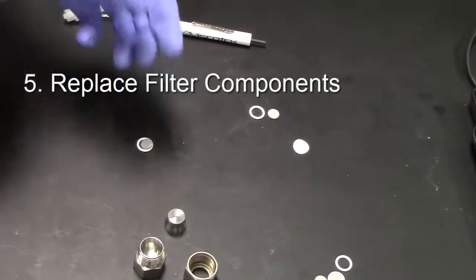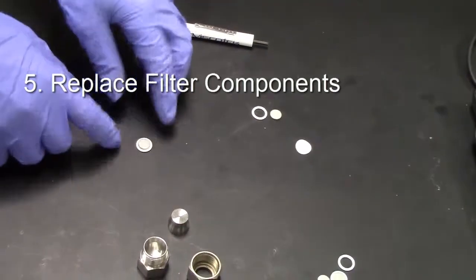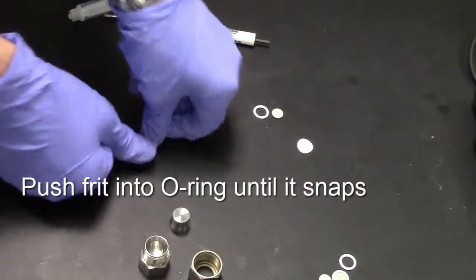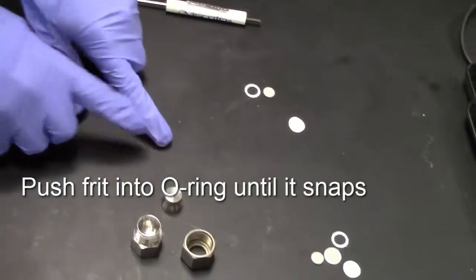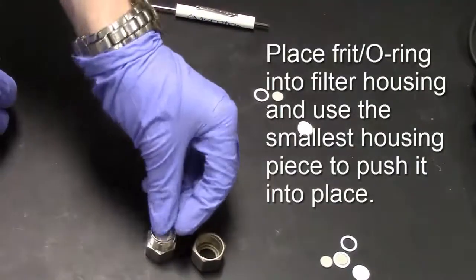Step 5. Replace the filter components. On a flat surface, place the new frit inside a new O-ring and push it into place until it snaps. Flip the pieces over to make sure that they're secure.